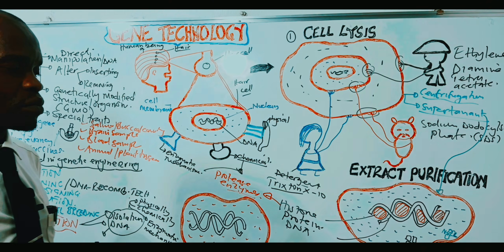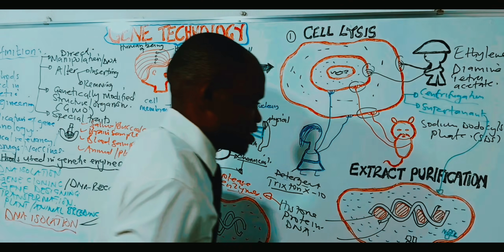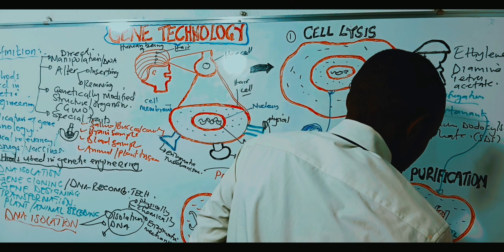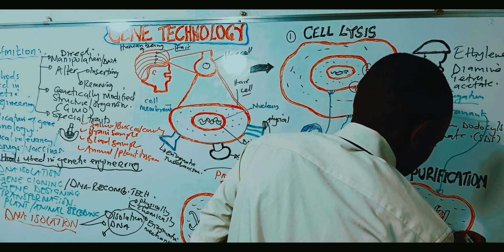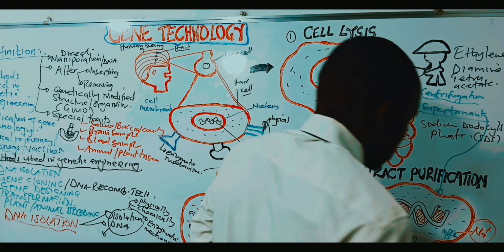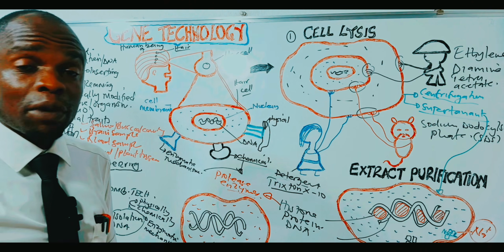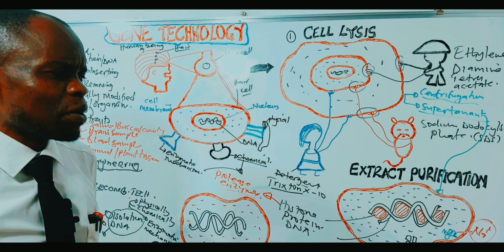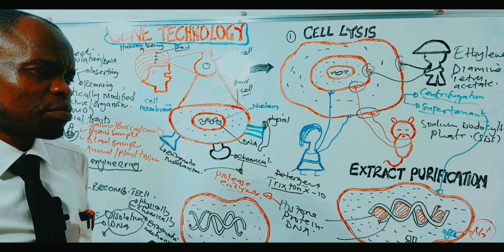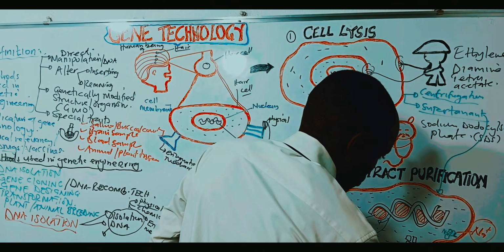Something very interesting. Now, what am I going to do about some ions here? Of course, these are mostly sodium, the sodium element, the sodium metal. And also these metals here, what am I going to do? Most of those ions, how am I going to remove them? I'm just going to bring a buffer, for example, sodium or potassium acetate.